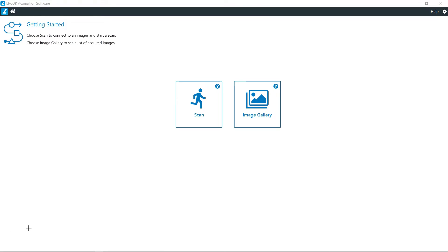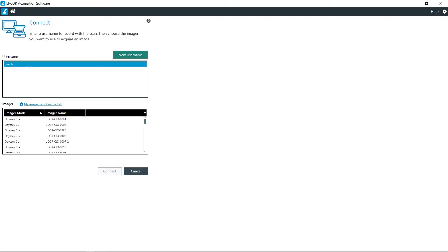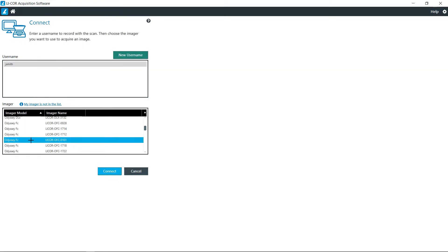Once you have opened the Lycor acquisition software, go ahead and click on scan, choose your username, and then choose the instrument that you want to connect to. Most of the time this will be just a single instrument on the list, so just click on that and then click connect.